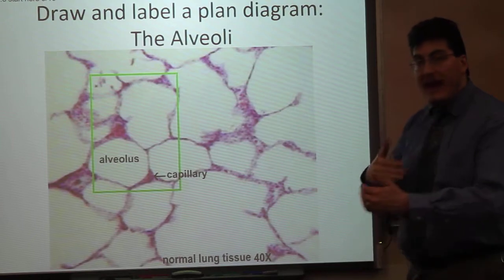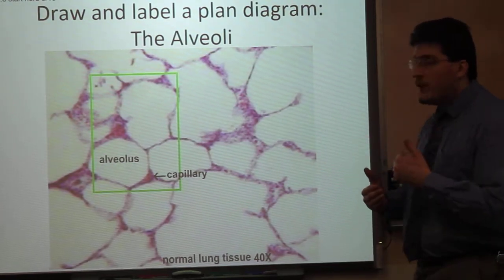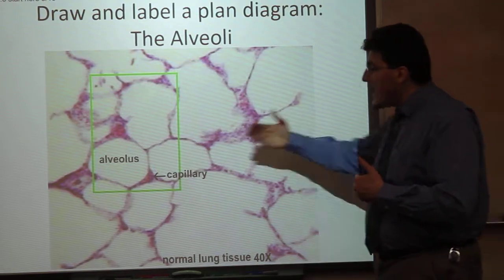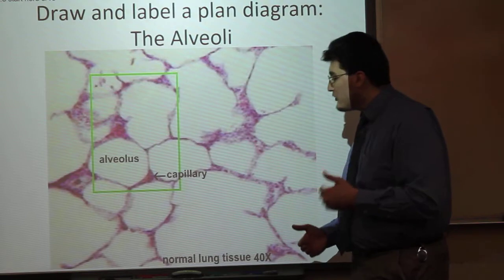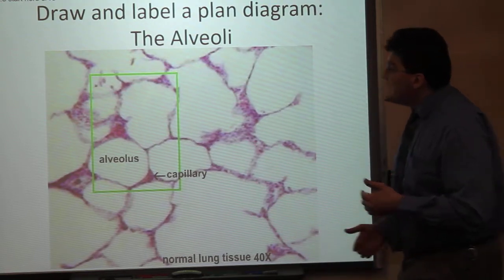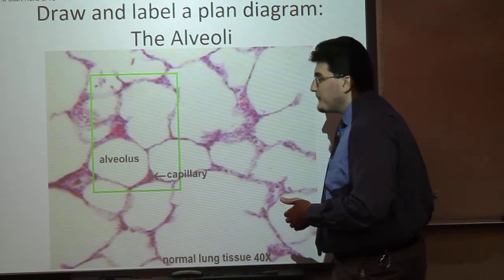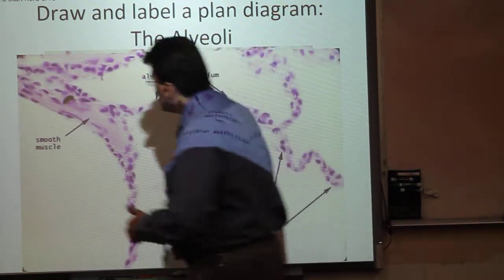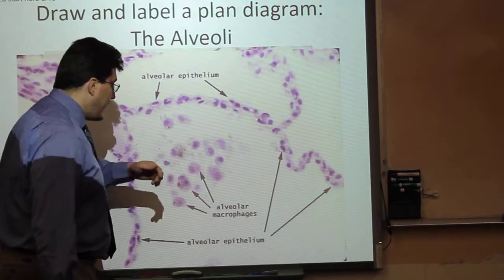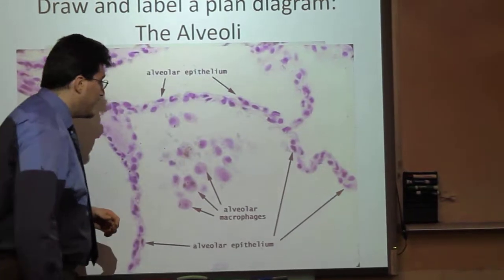I'm going to move oxygen and carbon dioxide across my respiratory surfaces, from the alveoli to the respiratory capillaries in my pulmonic circulation. And these capillaries are going to do that for me. All right? I'm not seeing cartilage anymore. Now, this image here is going to be showing me these alveolar macrophages, these dust cells over here.